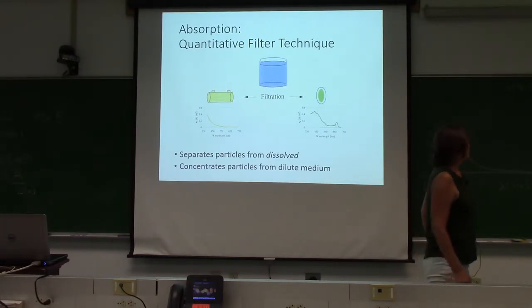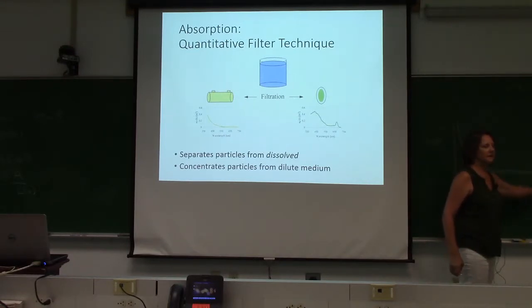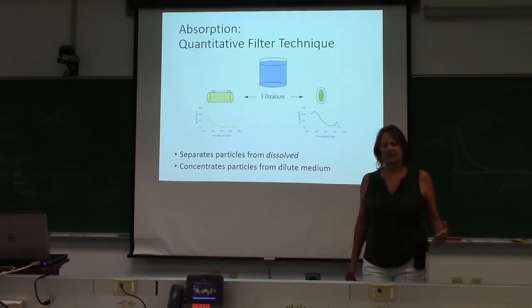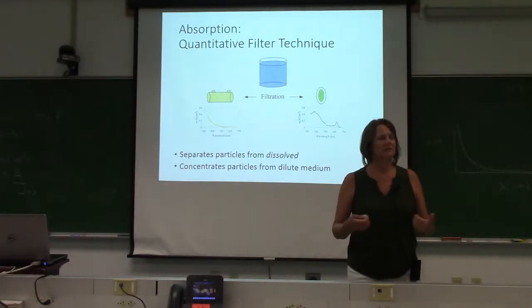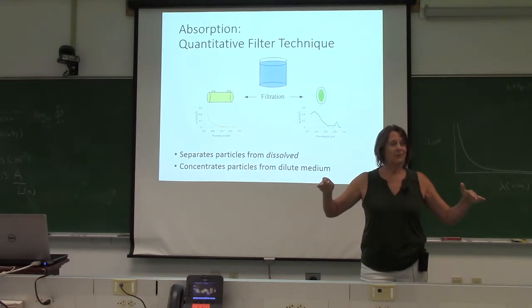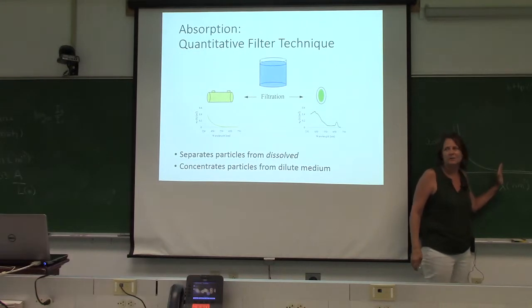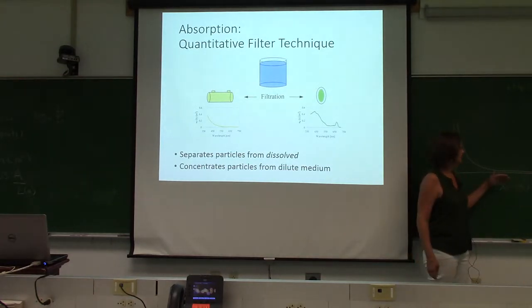So another thing to think about is if we just look at this, say from the green to the yellow to the red, and it's a constant low value, it's really hard to think about the type of molecular structure that would lead to a constant absorption over a broad wavelength range. There's often a peak and tails. So part of the justification might be, well, it can't be absorption because the physics of absorption don't predict this type of behavior. But then it means that you've got scattering in your cuvette, so then you need to think about that.